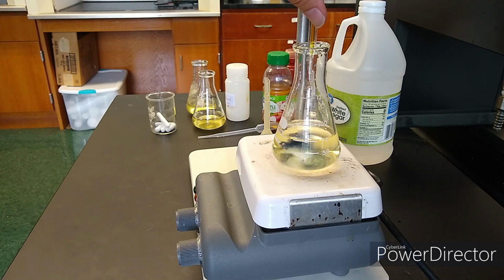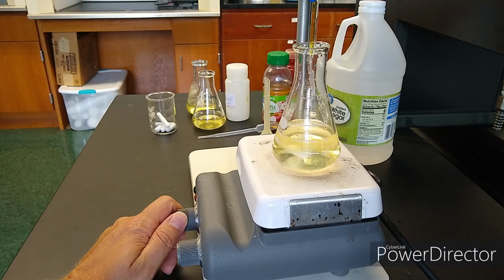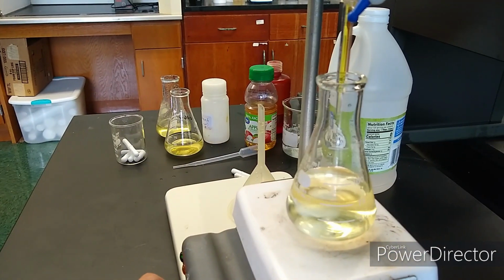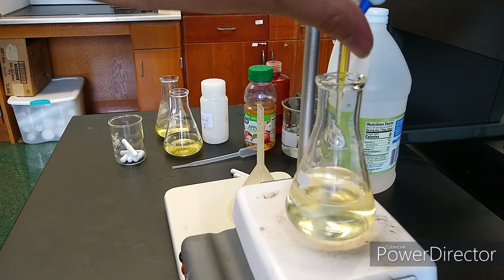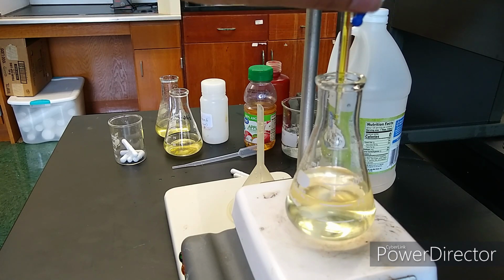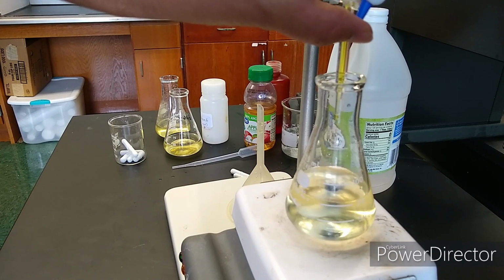I'm almost to 20 milliliters. Actually, I'm at 17 milliliters right about now, and I'm going down to 18 milliliters. It's still disappearing pretty quickly. But I'm going to go ahead and turn this up higher. I'll zoom in even closer here. And if I add 1 drop of iodine, oops, that's not a drop, that was a little stream. There's drop-wise. You see the drops coming out. I can slow it down. That's the advantage of the burettes. You can control that drop extremely precisely when you try.